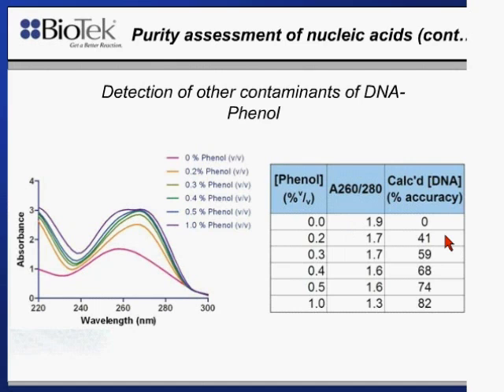So take-home message from this slide is, yes, phenol can probably be determined even at very low quantities and easily determined that it's phenol, mainly by looking at the spectral scan, but we will certainly be clued into a contamination simply by looking at an A260-280 ratio.